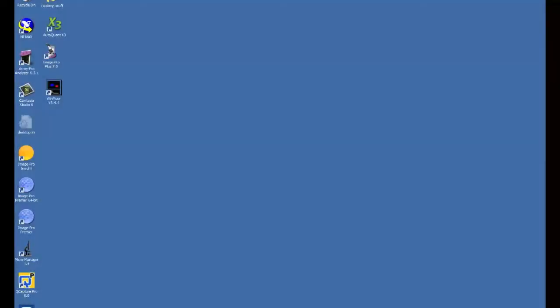Hi, this is a quick movie taking you through how to configure the Winfluor software. In the previous movie we ran through the hardware setup, so this time we're going to have a look at the software and how to actually get started.